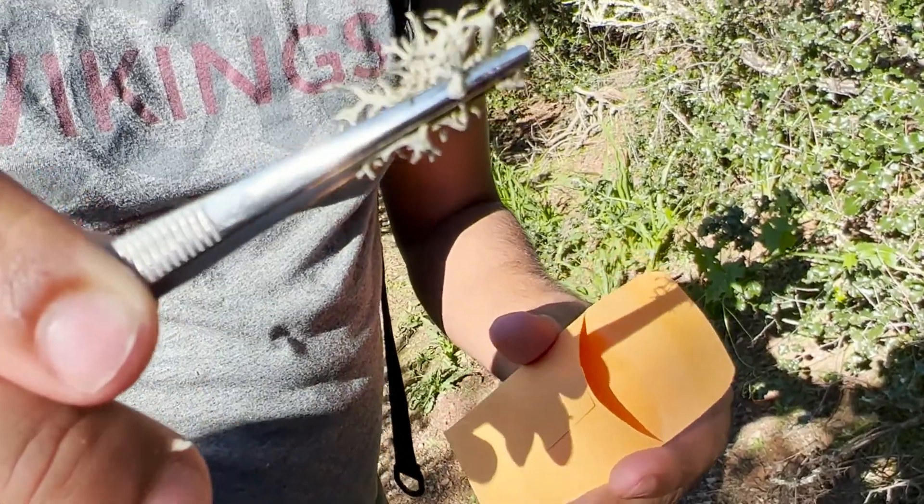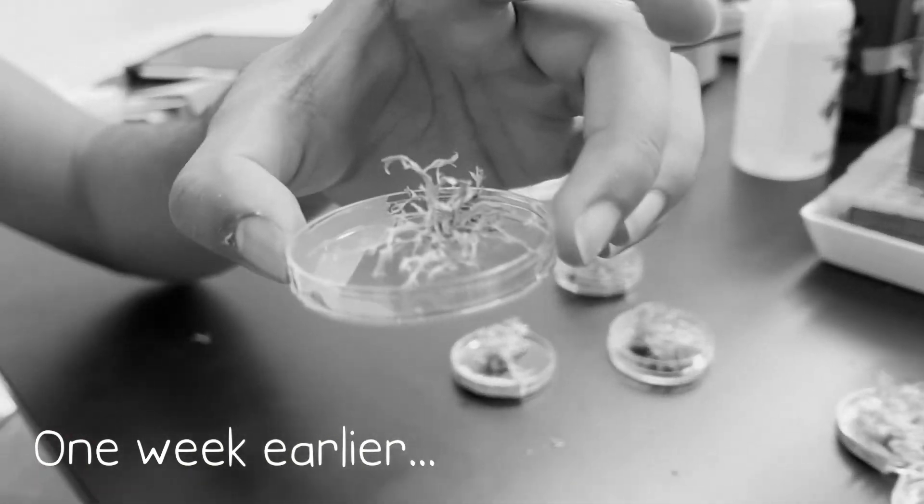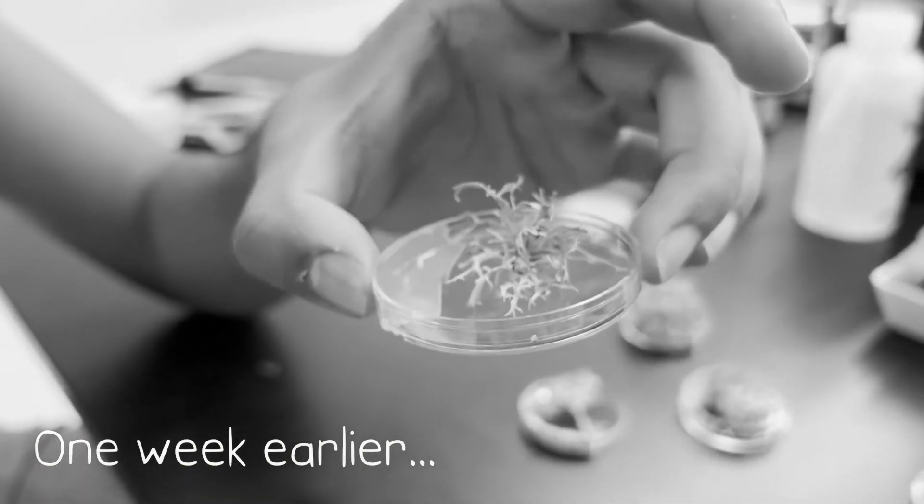That looks like a vernia, right? Yeah, it's a vernia probably. So this sample right here is actually not a vernia — it's ramalina.